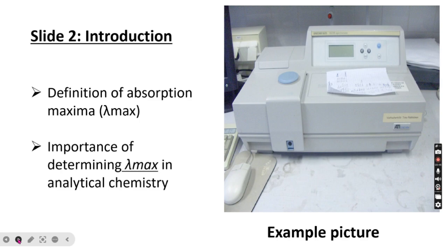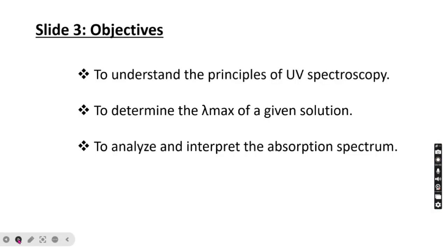Let's see slide 3. Objectives: to understand the principle of UV spectroscopy, to determine the lambda max of a given solution, and to analyze and interpret the absorption spectrum.